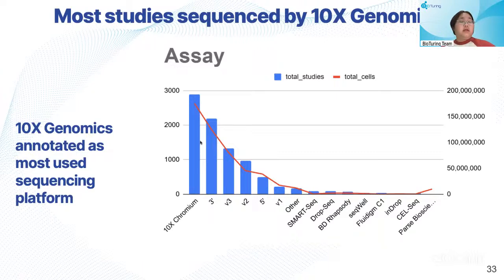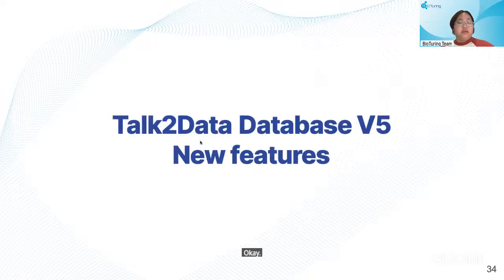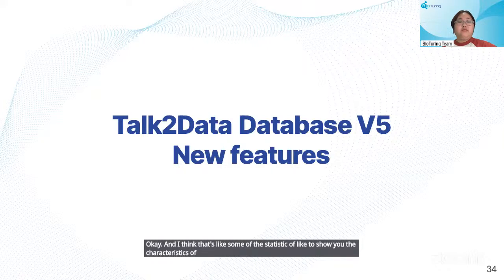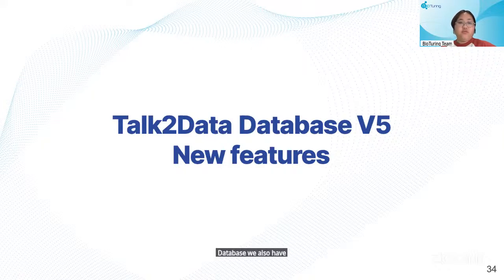Okay, and I think that's some of the statistics to show you the characteristics of Talk2Data version 5, our new database. I just want to quickly show you that along with the new database, we also have new features and a new UI.